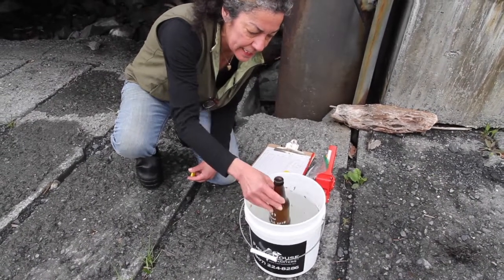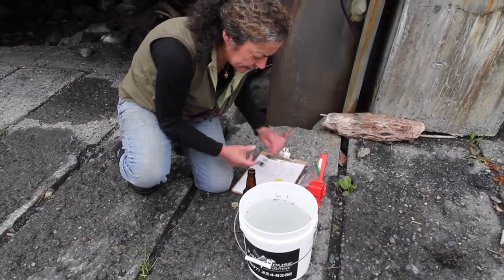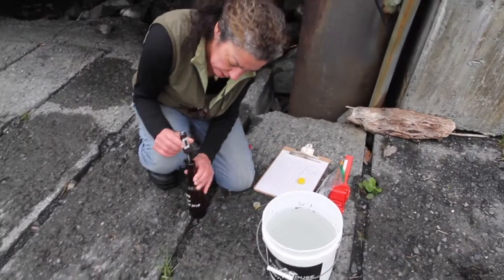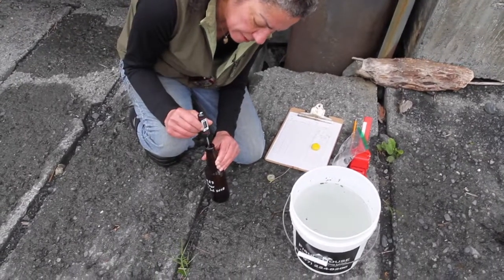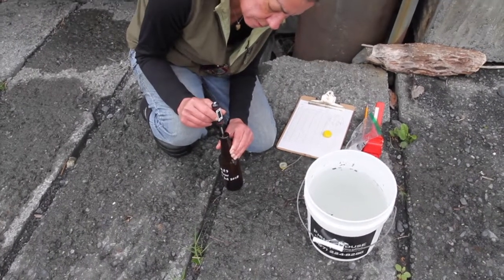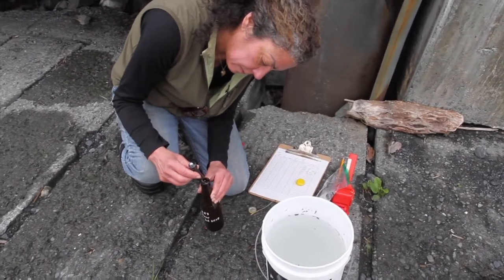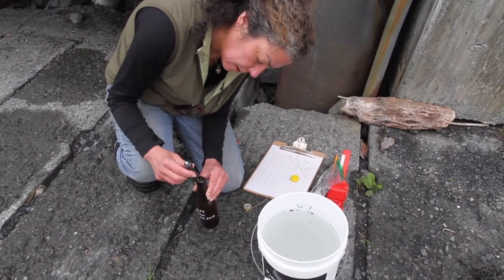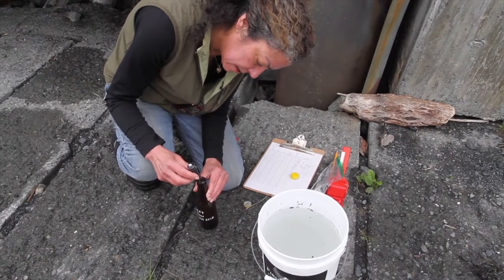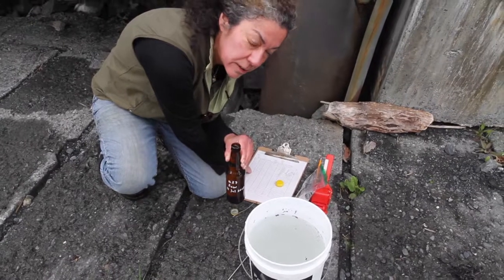Once the sample has been taken and the bottle has been filled, we want to go ahead and take its temperature. We'll just stick that in there and wait for it to stabilize. It's now stabilized — looks like it's about 8.1. I'll note that on my log sheet along with the date and the bottle number.